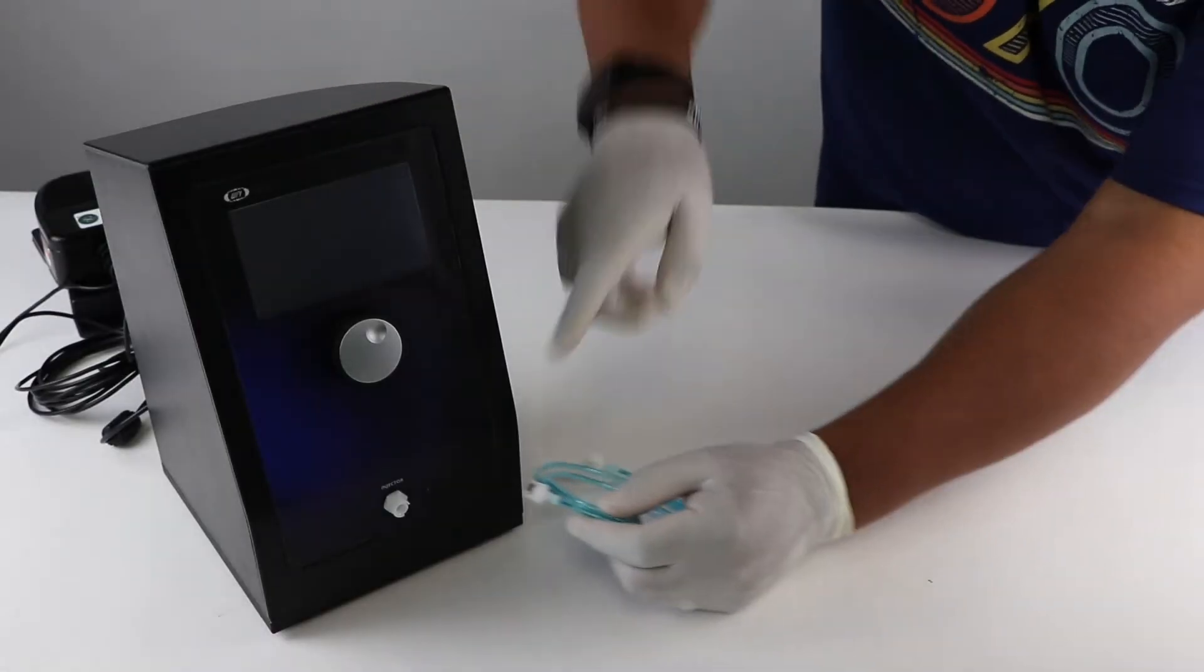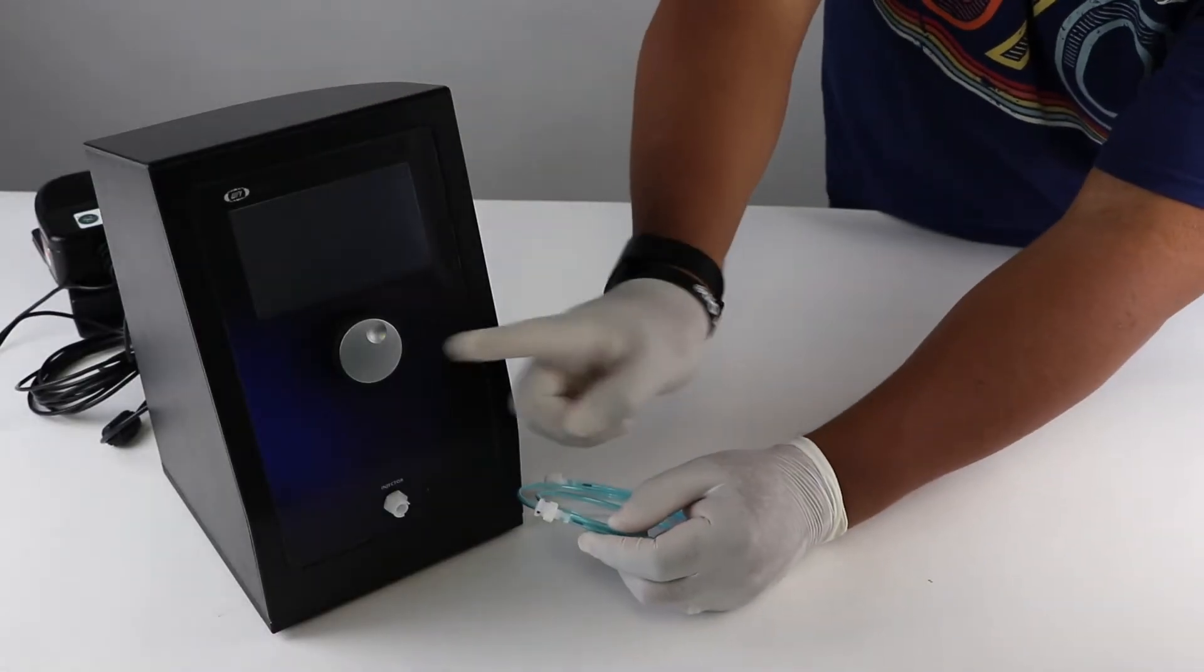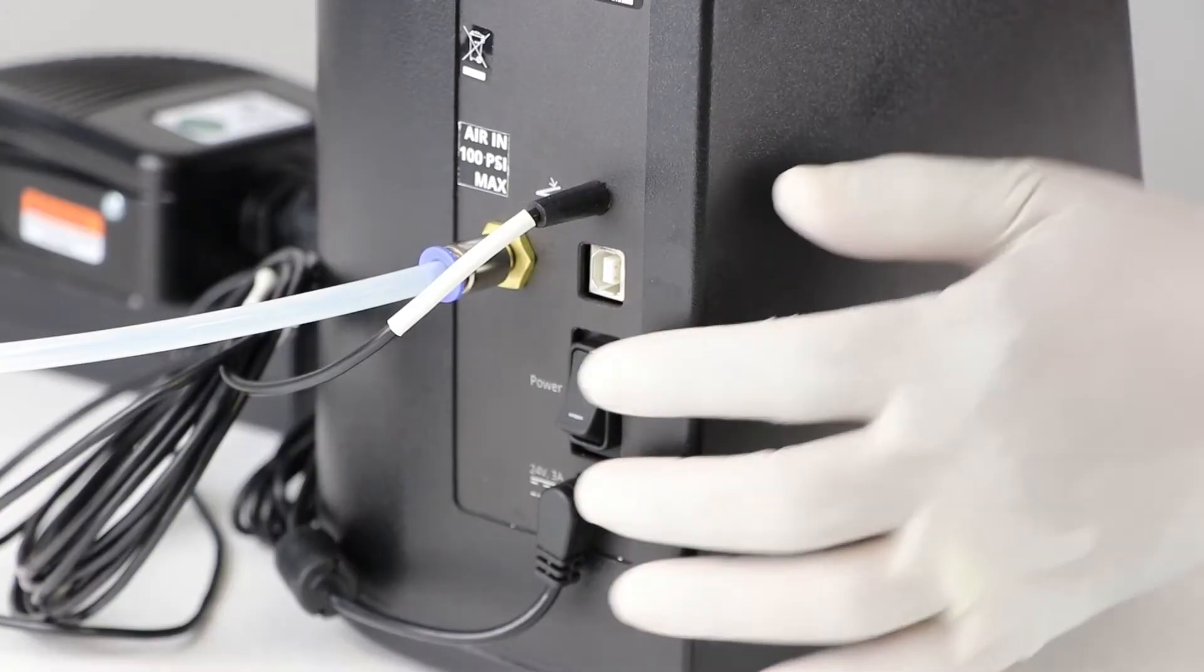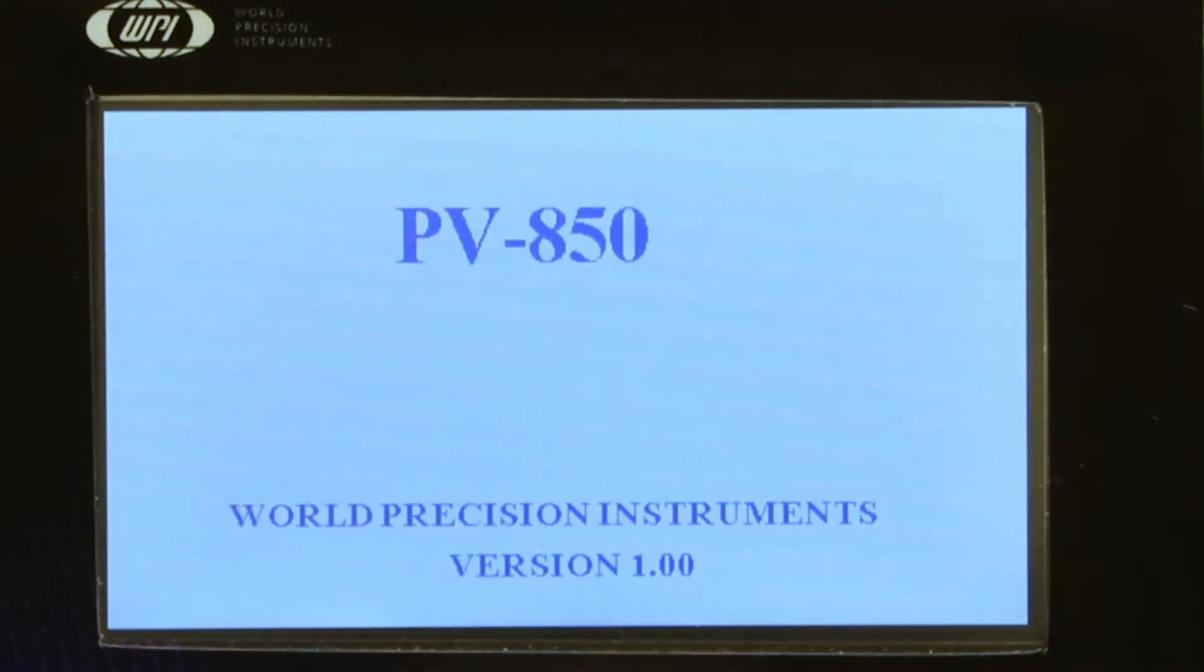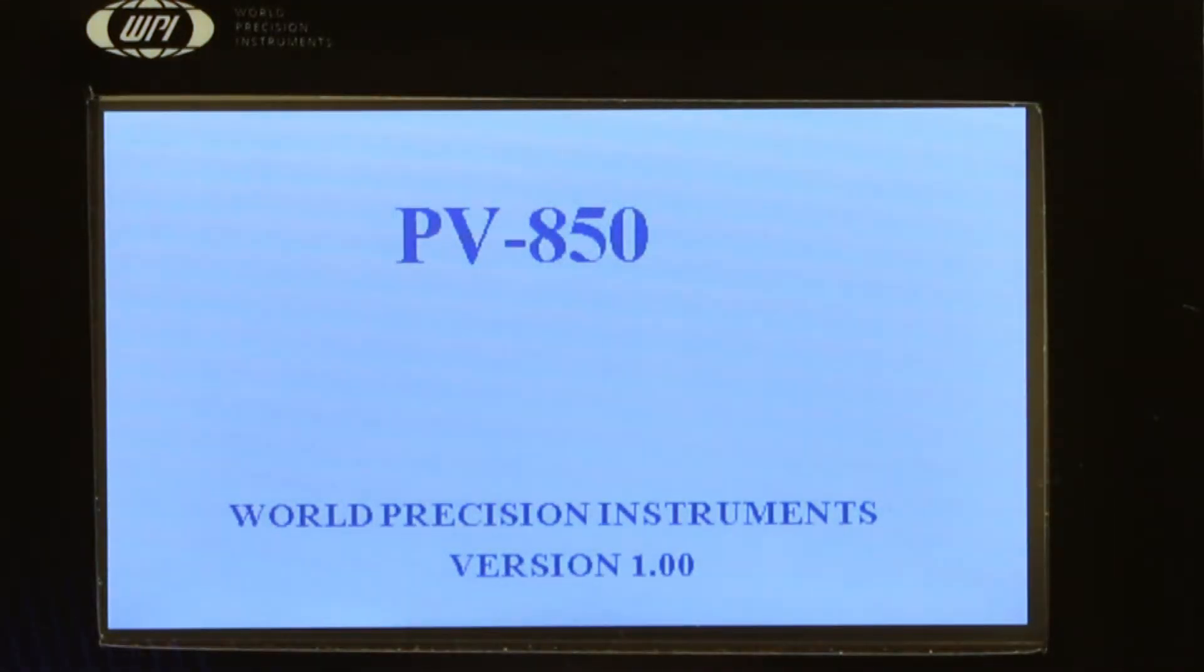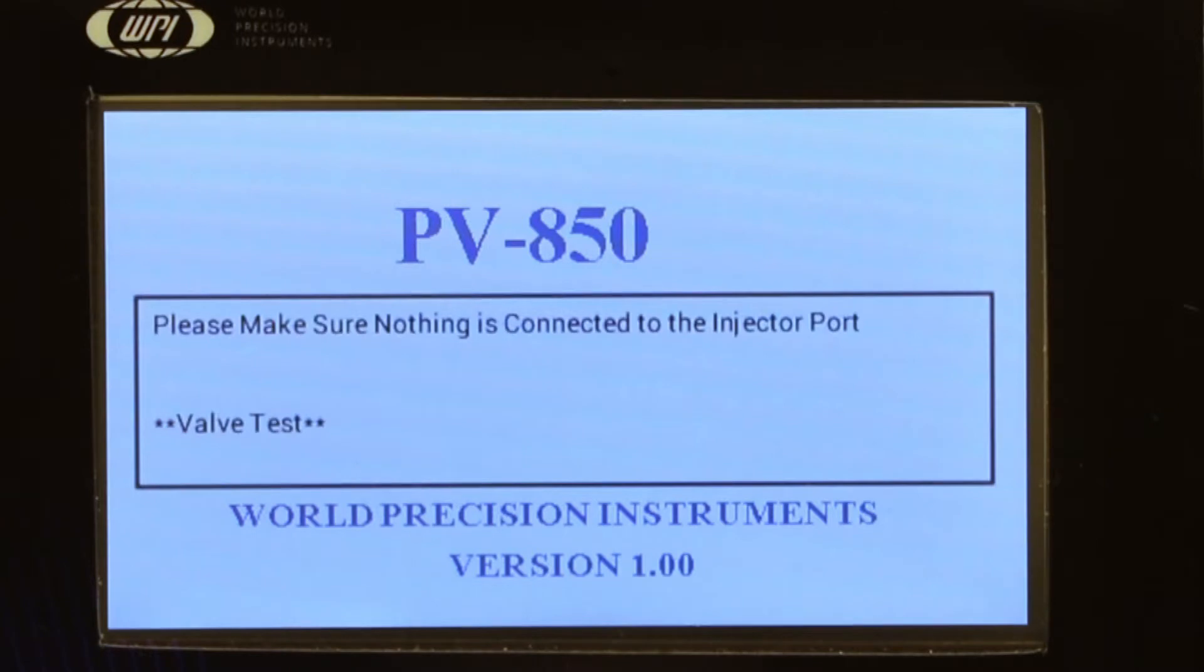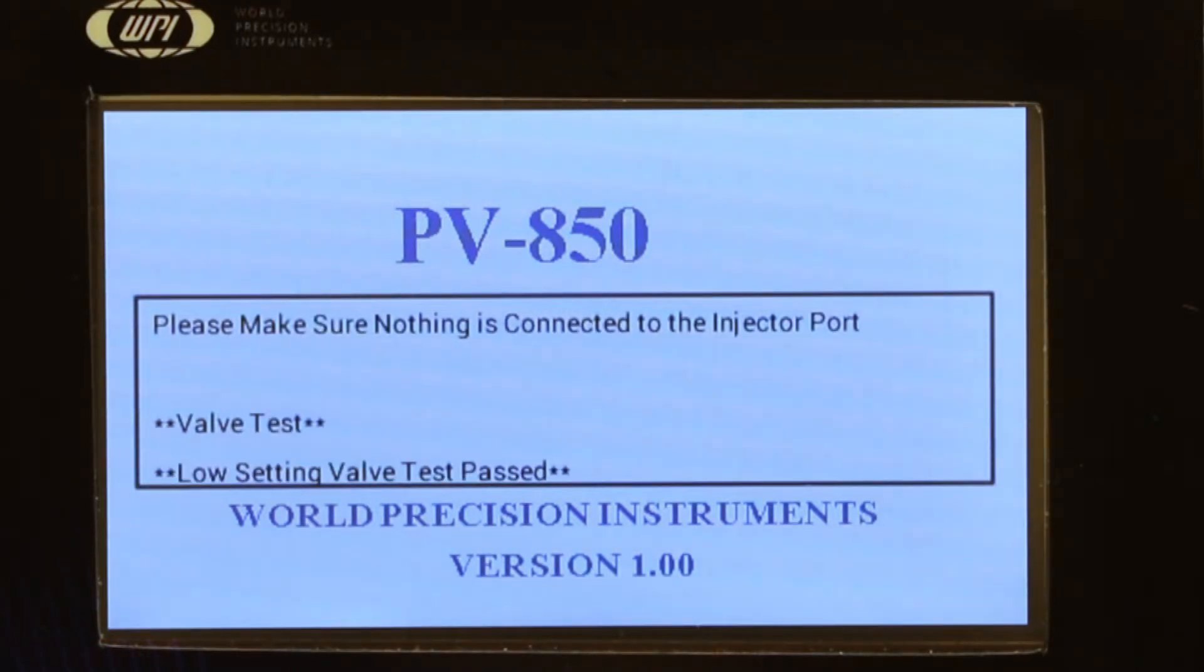Do not plug in the capillary kit yet. Power on the PV850. On power up the startup screen appears and the PV850 performs a self-test. After the self-test completes, we can plug in the different required components.